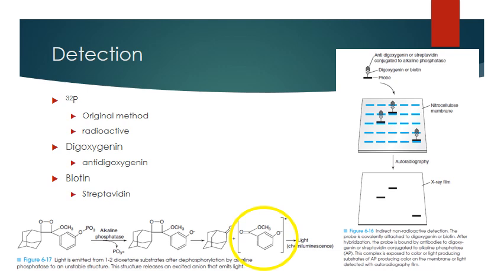detect them, okay? So in the case of light production, the most common one used, I think you guys have been most exposed to, is horseradish peroxidase, and that can be used in this procedure as well. And then your detection method will depend on what your signal is. Is it light? In the case of the 32, is it radioactivity? Is it a chromogenic signal? You know, light is the most common method at this point. And so you use a luminometer to detect the light. Very simple.